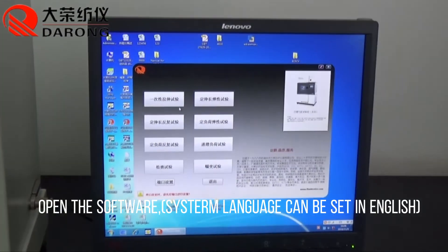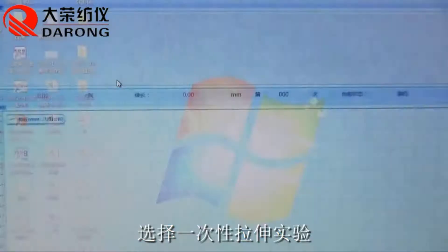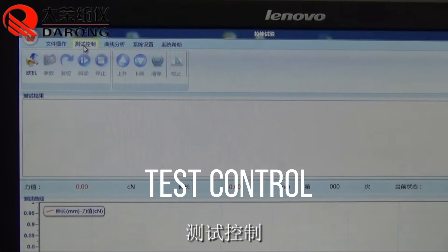Open the software. The system language can be set in English. Go to Test Control.